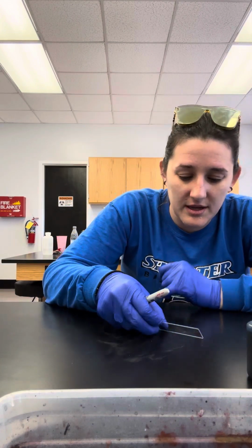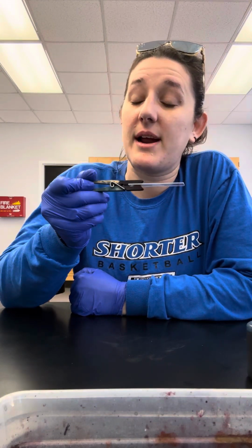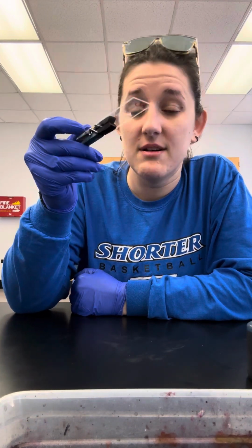Alright, so this is good enough for our intents and purposes. For yours, I want it air dried. For this, it's fine. So this one we heat fix. We heat fix on gram stain. We do not heat fix on negative. That's in the negative video. Go see the negative video.